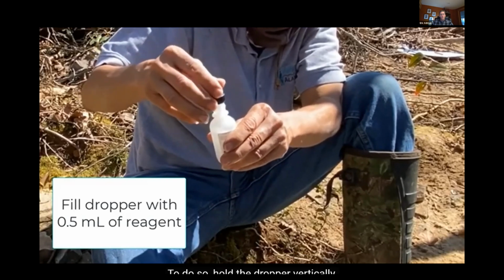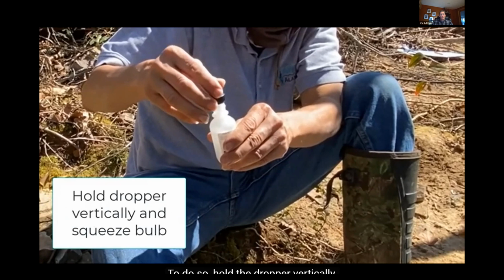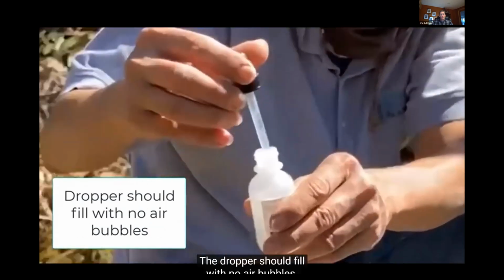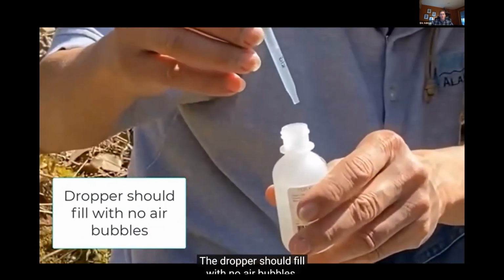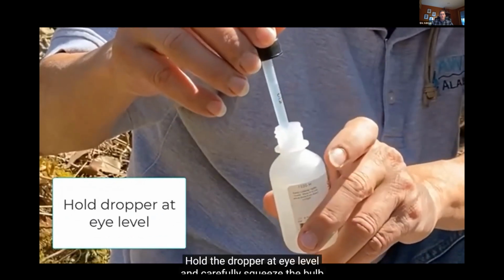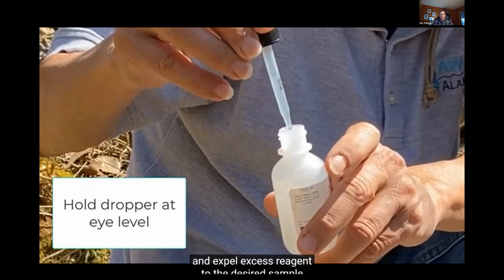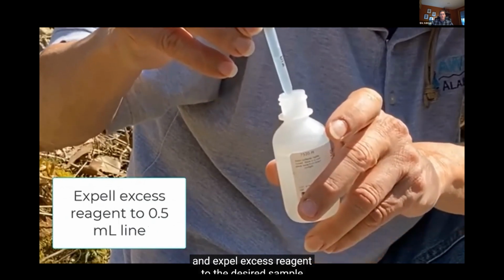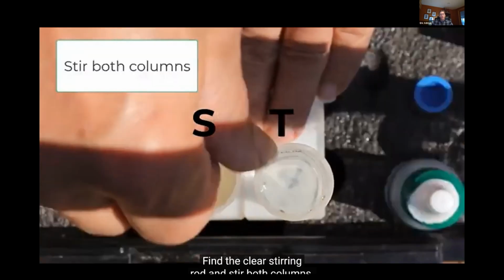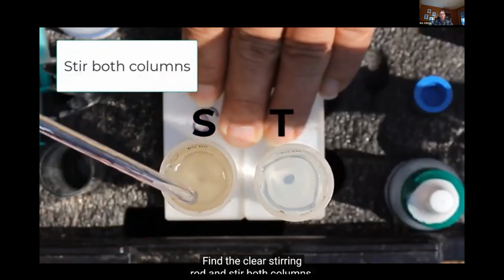To do so, hold the dropper vertically. Squeeze the bulb and then insert the dropper into the reagent bottle and release the bulb. The dropper should fill with no air bubbles. If air bubbles get into the dropper, squeeze the bulb to empty the dropper and refill it. Hold the dropper at eye level and carefully squeeze the bulb and expel excess reagent to the desired volume marked 0.5 ml. Find the clear stirring rod and stir both columns.